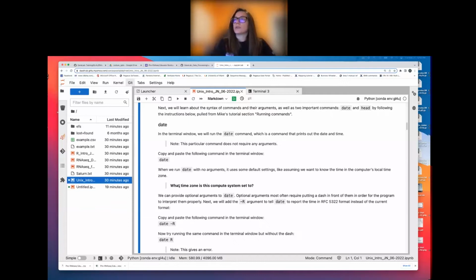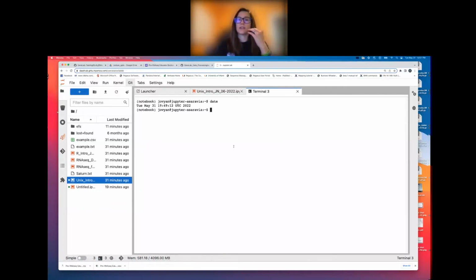Okay, so all of the questions that I prompt you in here, I'm going to ask you through a poll, and then you'll be able to submit your answers. So I'm going to go ahead and open this poll. And then you should have all seen a poll question. If you can answer that poll, I'll just wait till everyone's done answering. This is asking the question, what time zone is a computer system set to? You should get that information from looking at the output of our date command in the terminal window.